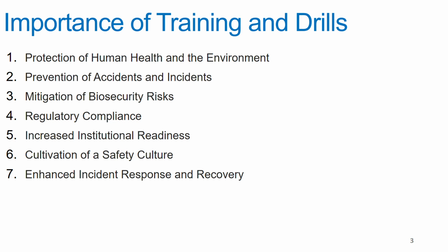You're also testing the system itself. Therefore, you are going to increase the readiness of an emergency response, or any type of response that you may need in the laboratory. Then culture of safety, or cultivation of a safety culture.